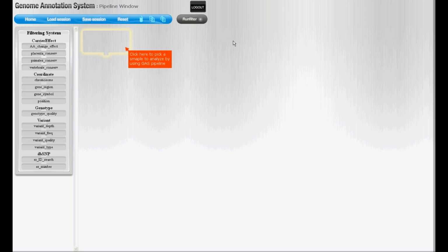Now let's walk through an example of a few interesting protocols. First, we will select one sample. In this case, I will be selecting sample 9. The variant count number tells you how many differences you have compared to the reference genome generated by the Human Genome Project. In this case, this individual has roughly 4.6 million differences from the Human Genome Project. Just a reminder, variants are any differences and in this case include SNPs, insertions, deletions, or copy number variants.